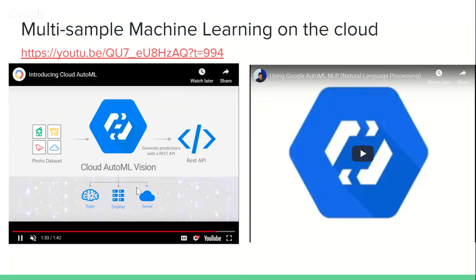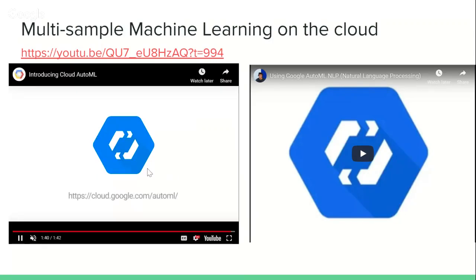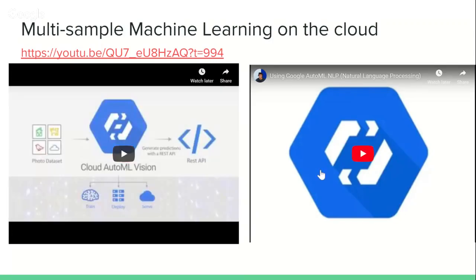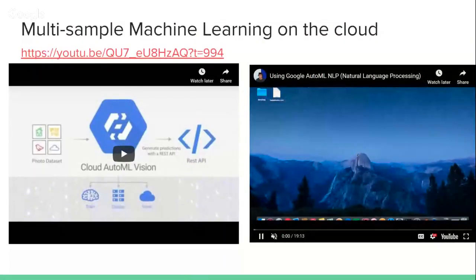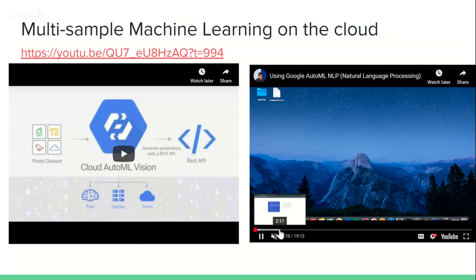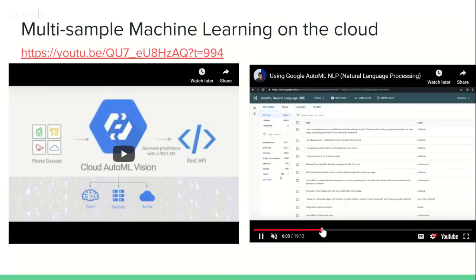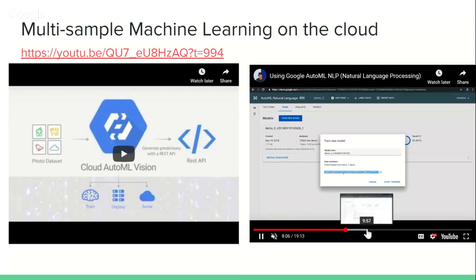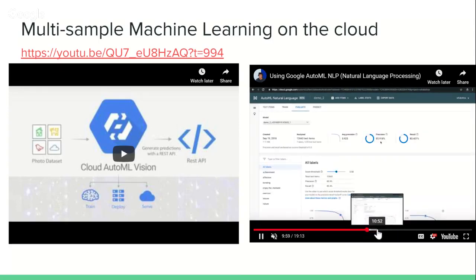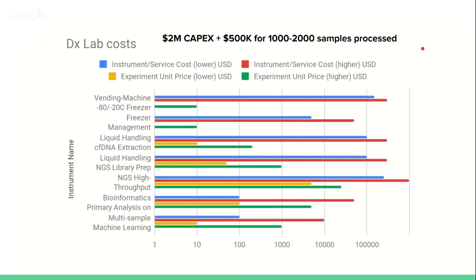So what we've shown here as an example in this video, classifying pictures of clouds in the classifier that you've trained, is not at all different from doing the same with bioinformatics, with genomics data. That could be variants, or it could be read counts in different genes from RNA-seq, etc. And so Google has been working hard to make sure the infrastructure underlying this work is as simple as possible, for people to concentrate on the biology that they know. And so at the end of this, you'll have a diagnostics NGS lab ready to go.